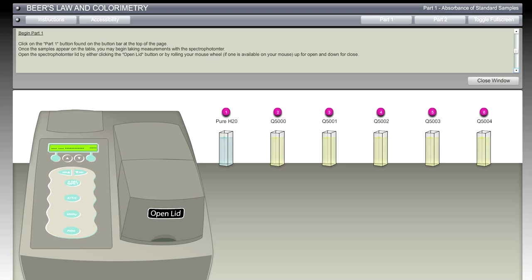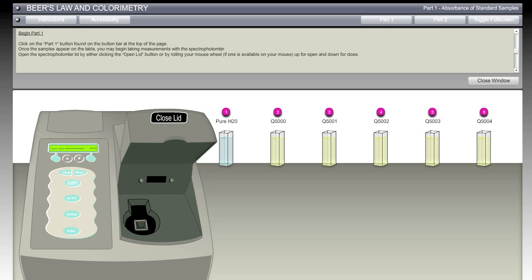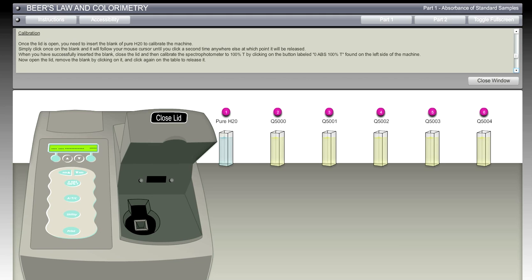Let's go ahead and start the first part of the lab. We already clicked on Part 1 and those six cuvette vials showed up. Once the samples appear on the table, you may begin taking measurements with the spectrophotometer. We're going to open the spectrophotometer lid by clicking on the open lid button.